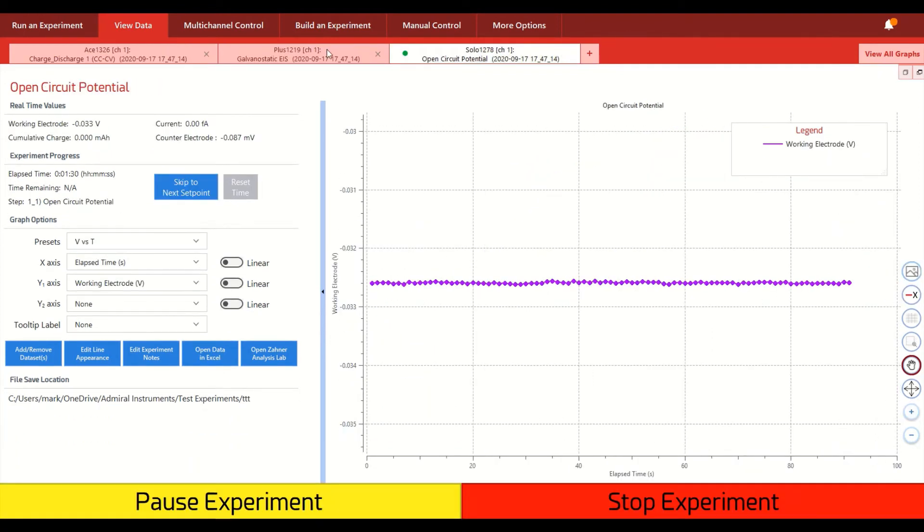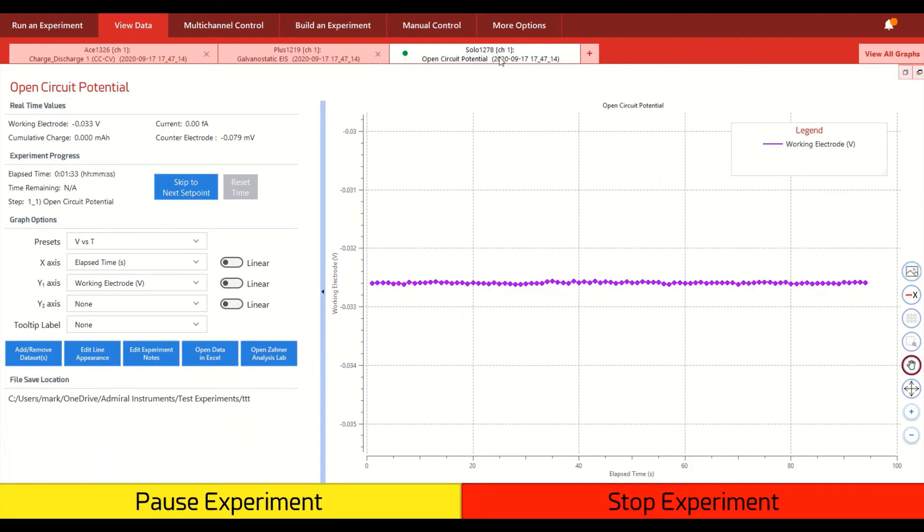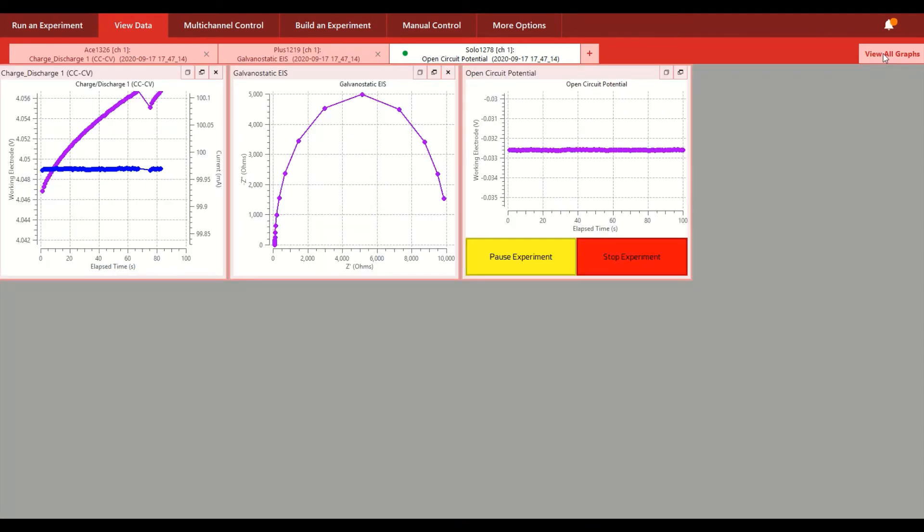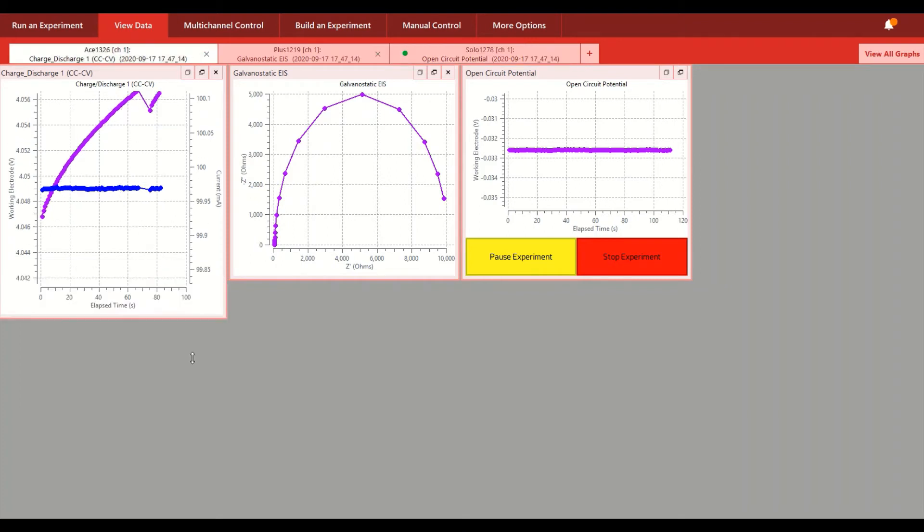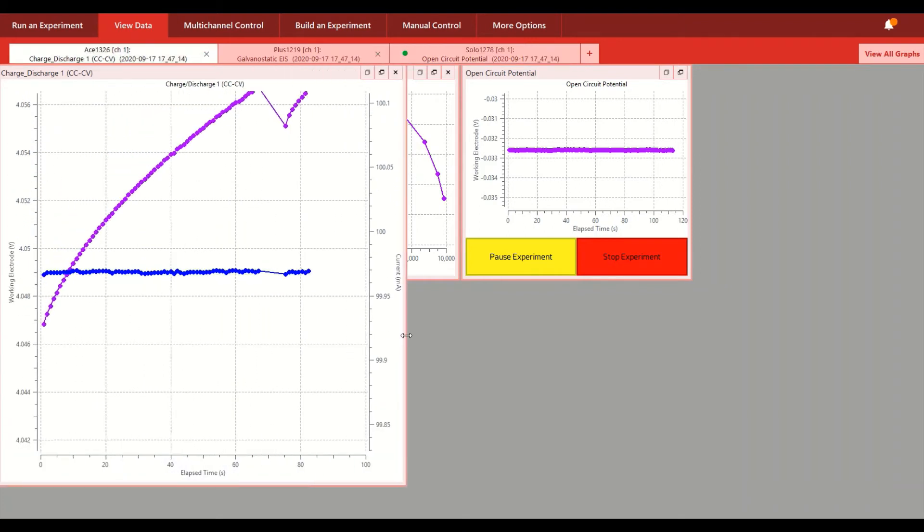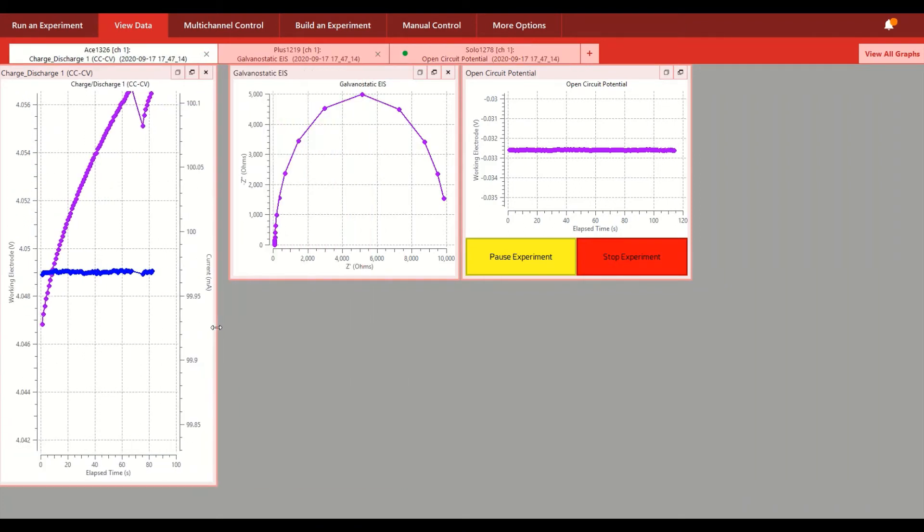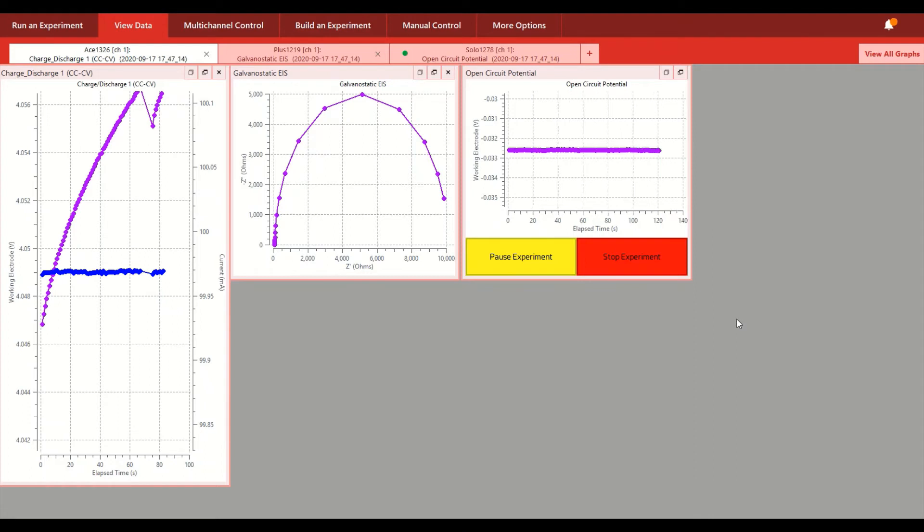Now all the different individual channels are shown in these tabs that are very similar to what you see from a web browser. But we also have this view all graphs button that allows you to show many different channels with their data at the same time. Each one of these windows can be expanded in any different ways that you want. With the standard square configuration here, you could see up to eight channels running at the same time.